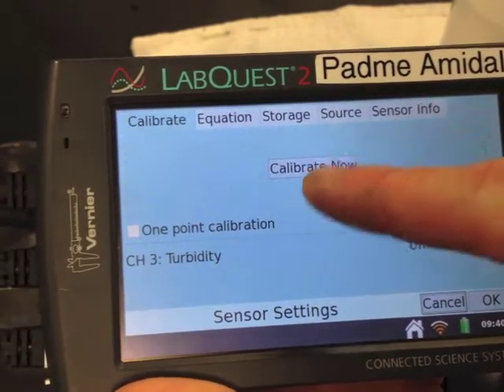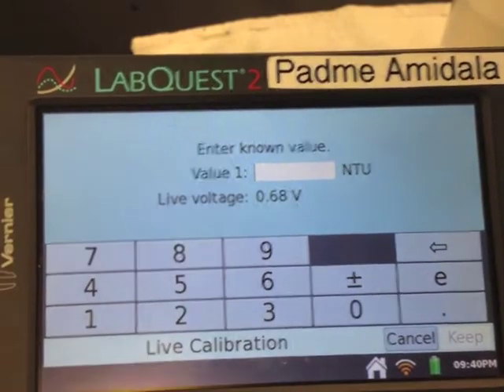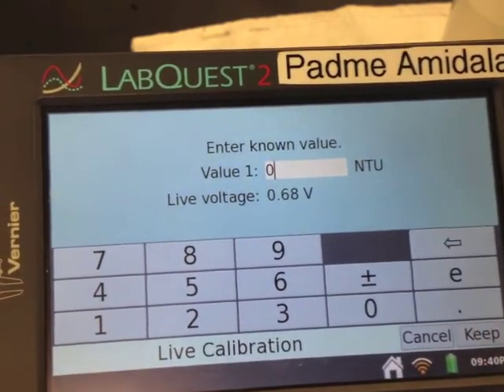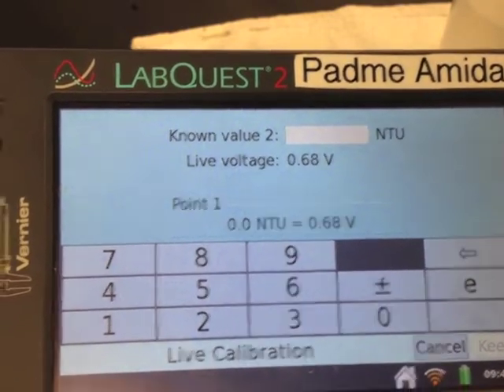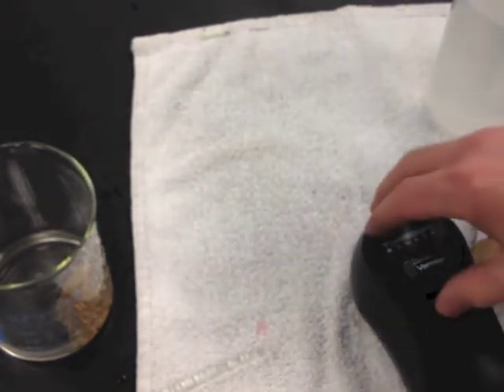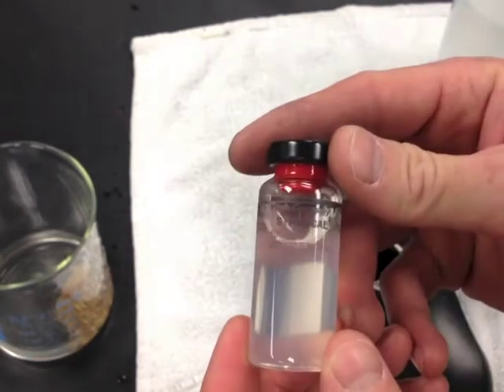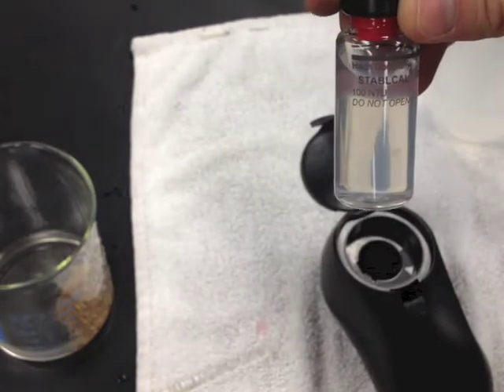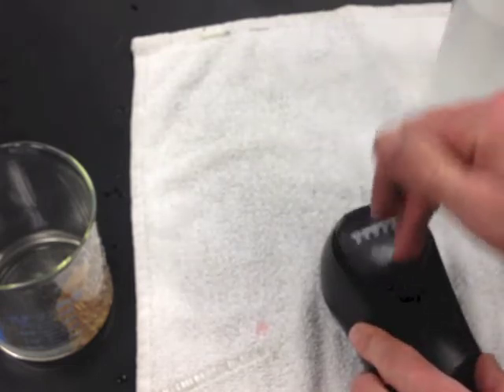Hit calibrate now. Enter the known value — you just put in distilled water, which is not cloudy at all, so the known value for distilled water is zero. Hit keep. It says enter known value two. Remove the distilled water and set it aside. Take the 100 NTU standard that came in the cardboard tube with your turbidity sensor. Make sure there aren't any air bubbles, line up the arrow with the arrow on the machine, and place that in the turbidity sensor.